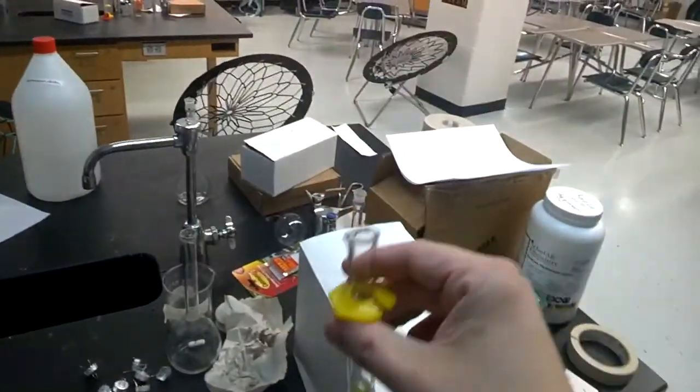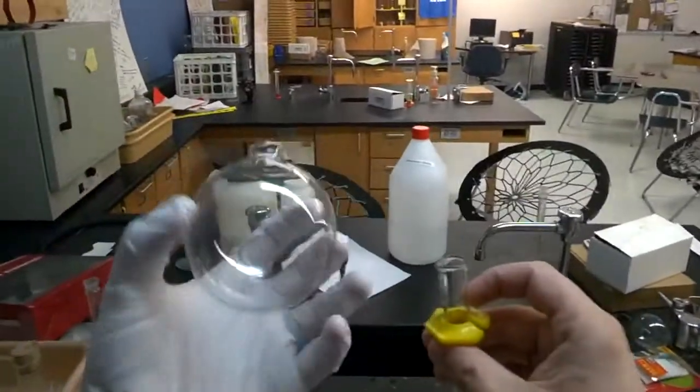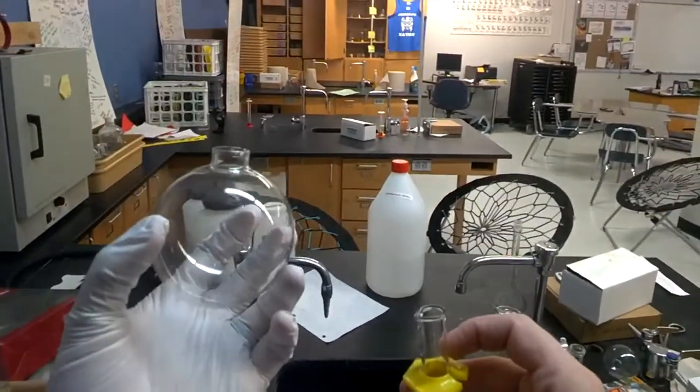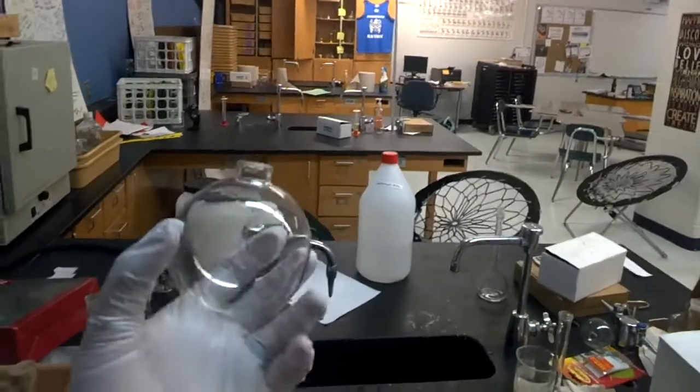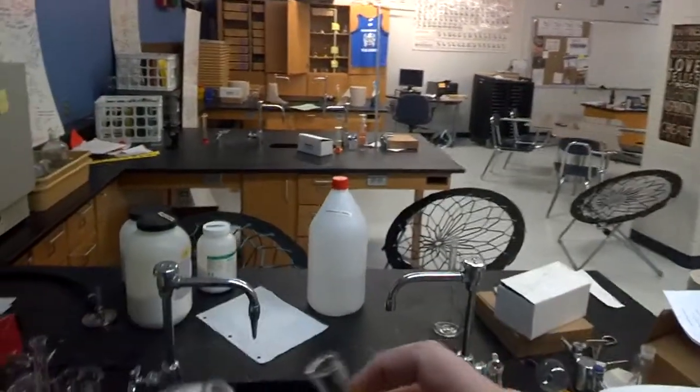Now what we need to do is we need to take our five percent dextrose solution and I'm going to add it to this glass ornament which I have rinsed with both distilled water and acetone to make sure there's nothing inside.